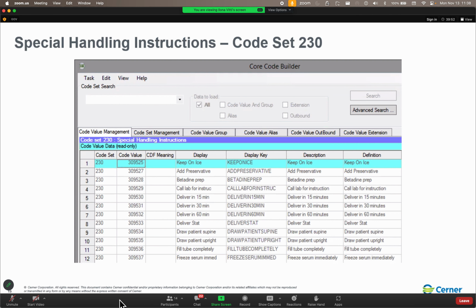All right. So once the global settings are made, then we can go over and create our accession classes. Now notice, when we create an accession class, we assign it an accession format. Every accession class gets an accession format.